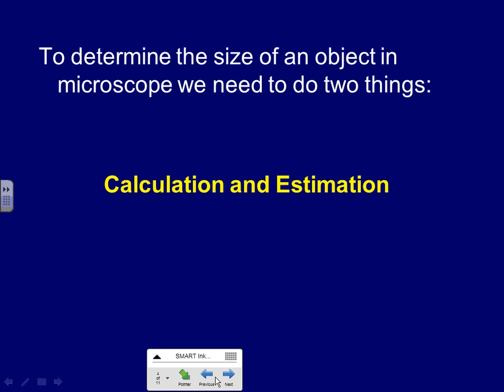All right? So the first thing I want to deal with is how do we determine the diameter of the field of view? And you're going to have to do this procedure in your microscope with a ruler. And during the procedure, whenever you use the ruler to maybe measure a field of view, I want you to snap a picture of it. Even though we're going to be looking at the hair, again, I'm going to ask you to snap some pictures of the hair. I want you to take pictures as you're measuring the field of view as well.